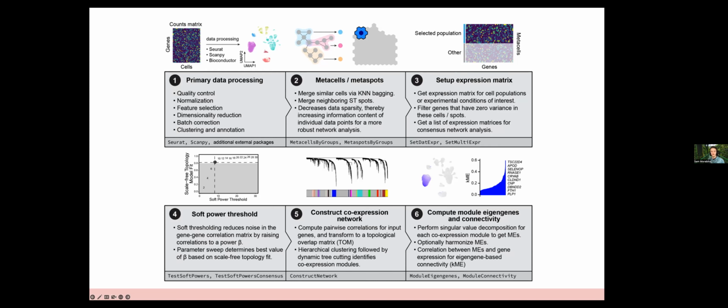analysis. Another thing to note about the metacells is that typically we do this process separately for each biological sample and each cell cluster. So you're not going to get a mix of different brain cell types. You won't have neurons and glia colliding. Also on that note, this whole package is very flexible. So if for some reason you wanted to allow for that, you totally can.